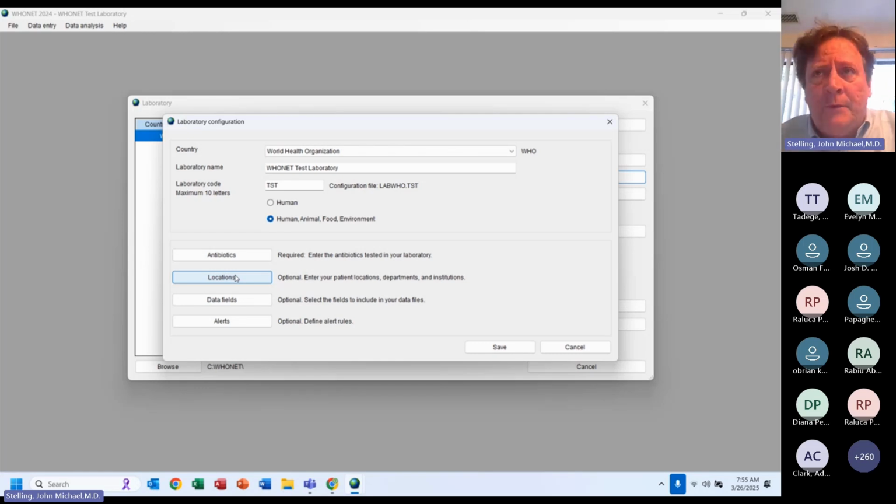They can be food restaurants, food markets. They can be water sampling sites. So location means where the sample was collected. Data fields, I can say first name, last name, animal species, food type. Those are all configurable. When it gives you a certain set, you can change it. We talked about that in the last webinar.